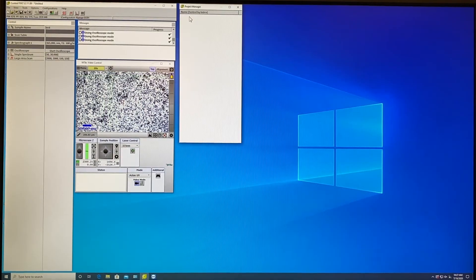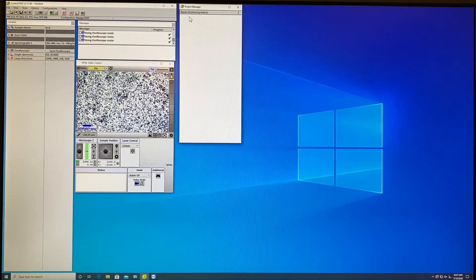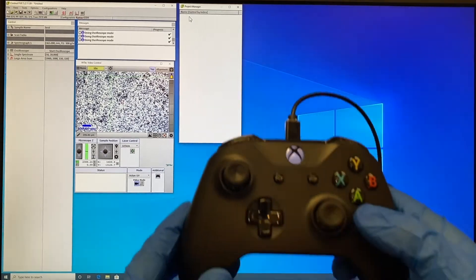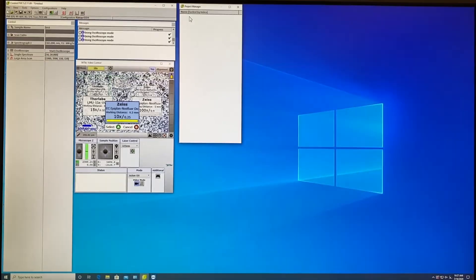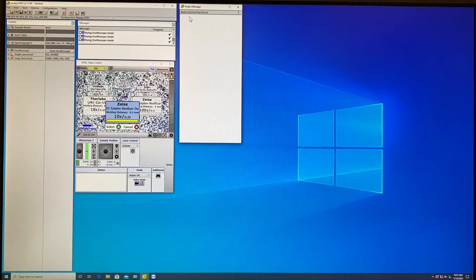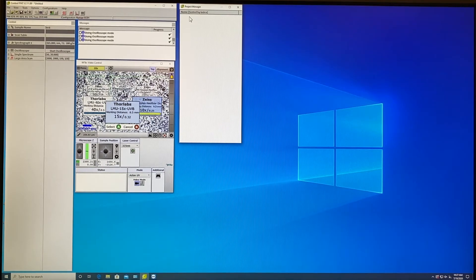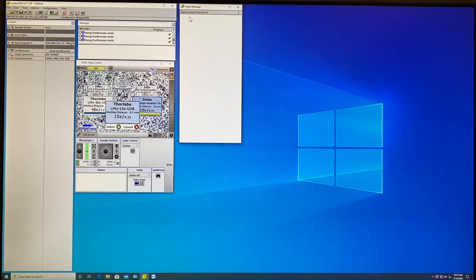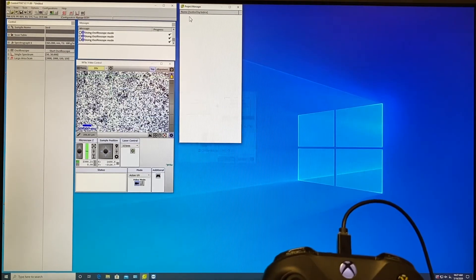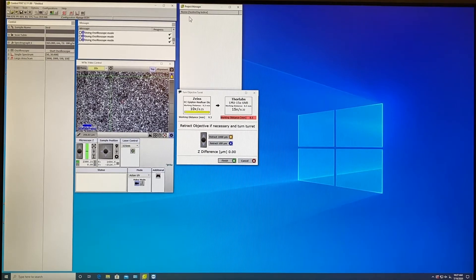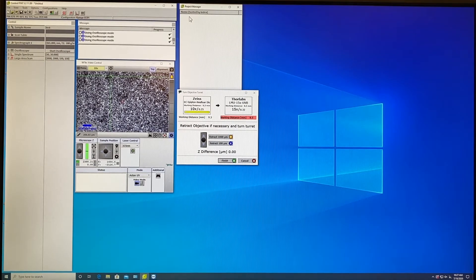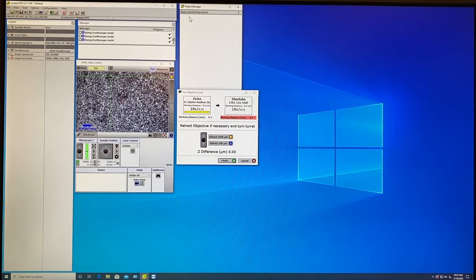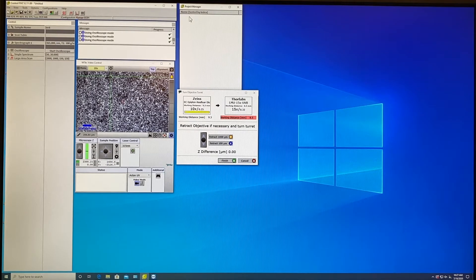After this you have to change the objective to UV. By pressing A button it will open this window in which you can select UV objective. This is only 15x. To choose this you press A and a new window will pop up which will ask you to retract the stage in order to have free movement of the turret so you don't hit your sample.